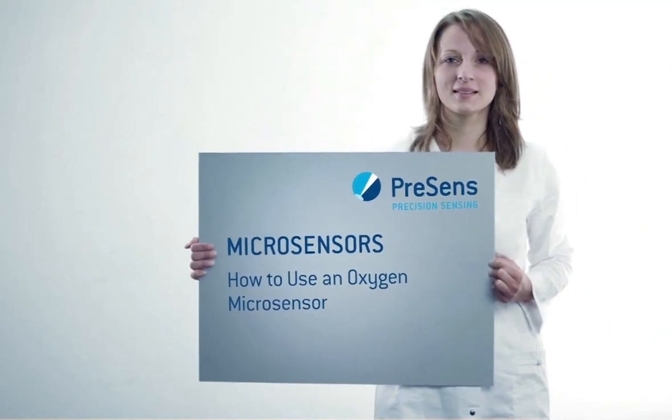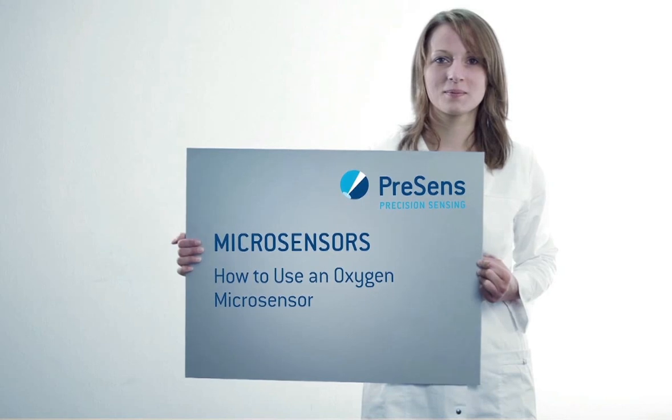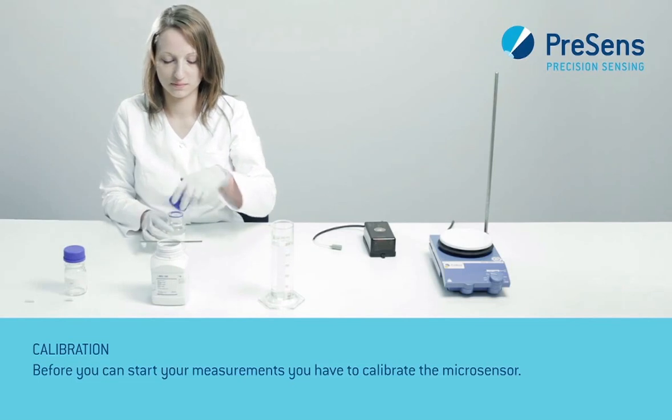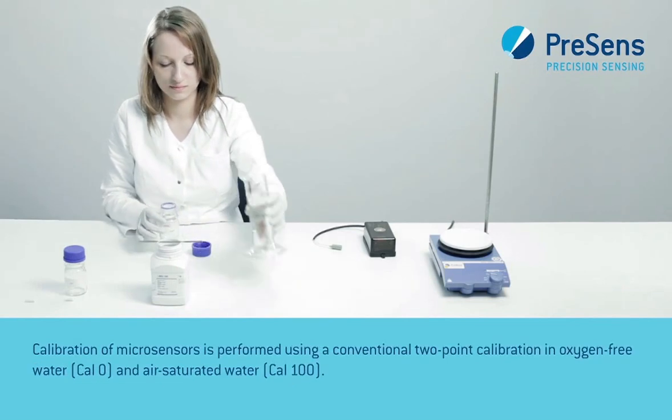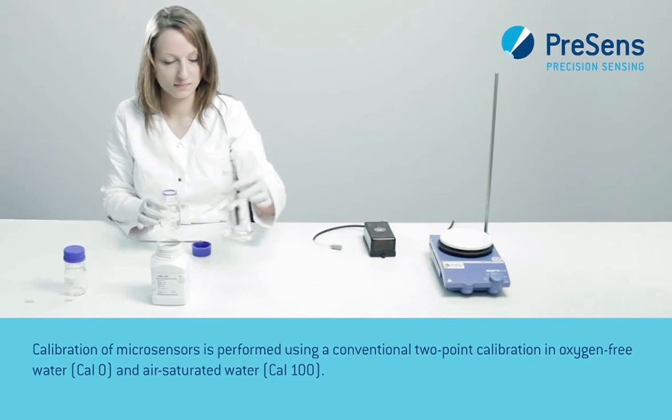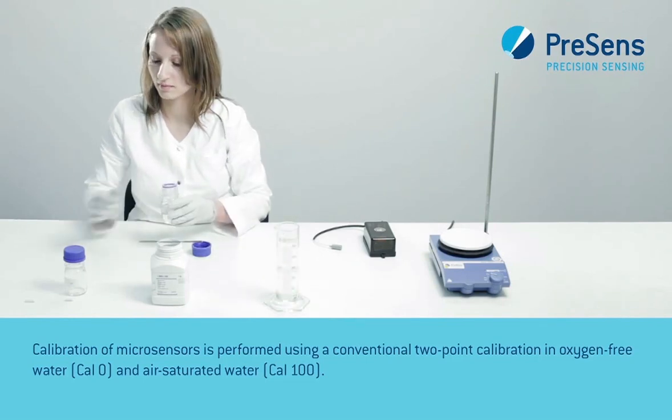Now we will show you how to use an oxygen microsensor for your measurements. Before you can start your measurements, you have to calibrate the microsensor. Calibration of microsensors is performed using a conventional two-point calibration in oxygen-free water and air-saturated water.